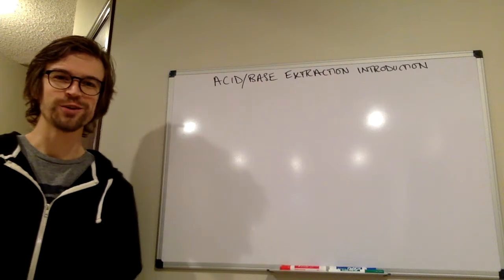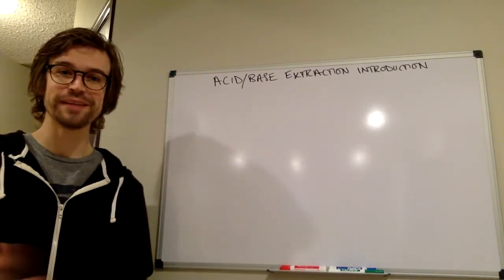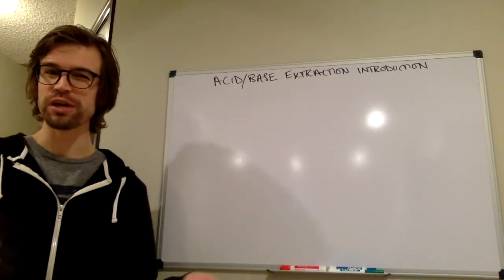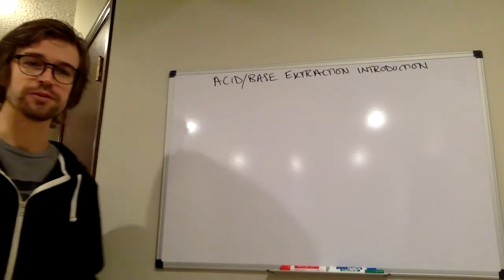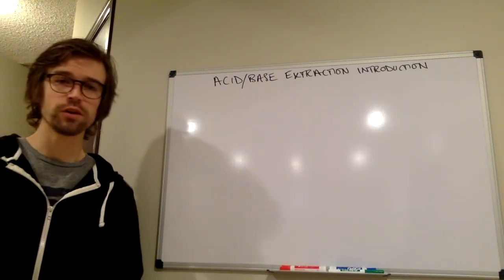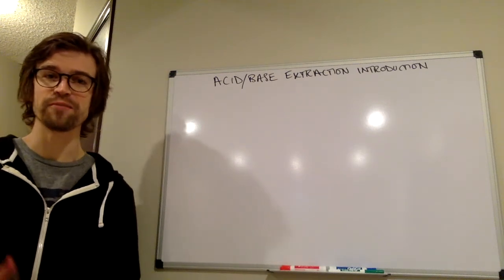All right, so today we are working on the acid-base extraction experiment, and I'm going to give you a brief intro on what the point of an acid-base extraction is, how does it work, all of those types of questions. So first off, what is acid-base extraction for? Extractions in general are another method of purification.